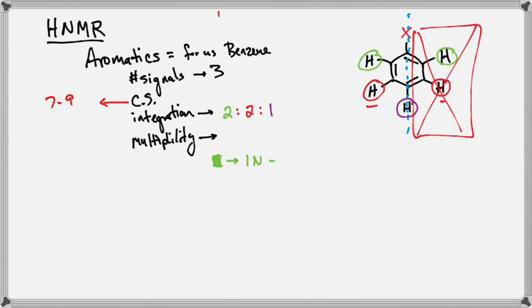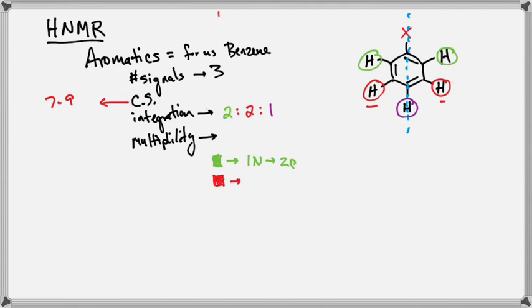One neighbor translates into, I need to backtrack that because I don't want that red box. One neighbor translates into 2 peaks. What does the red hydrogen see? We get 2 neighbors. Is anyone a little nervous with these 2 neighbors? There should be 3 peaks.